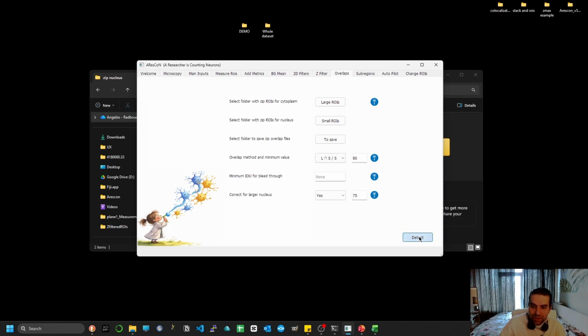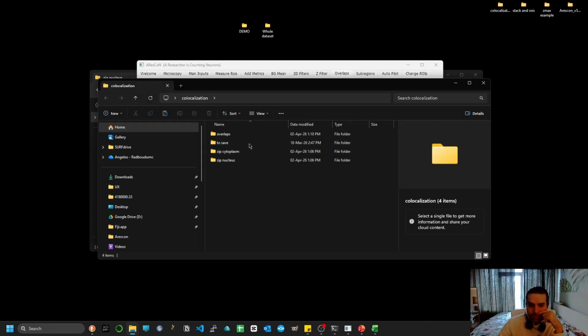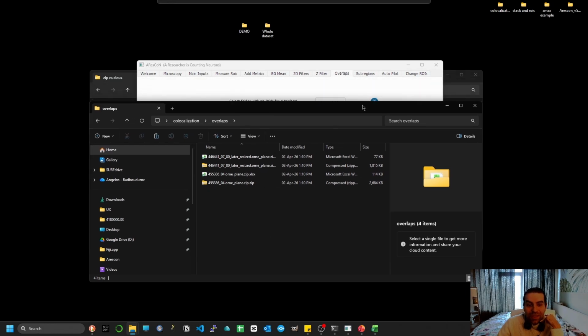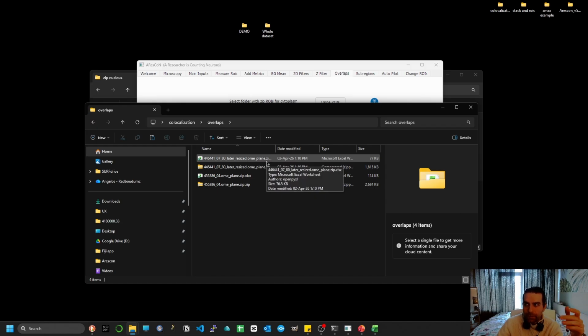Okay, if everything has been put correctly, you should get your results. Let's see. Okay, let's have a look. Oh, here, the overlaps, yeah. I was dumbfounded for a moment. So here what we have is the final regions of interest. If I'm not mistaken, they're based not on the intersection per se, but on the cell. But I really have to check about it. I don't remember by heart.